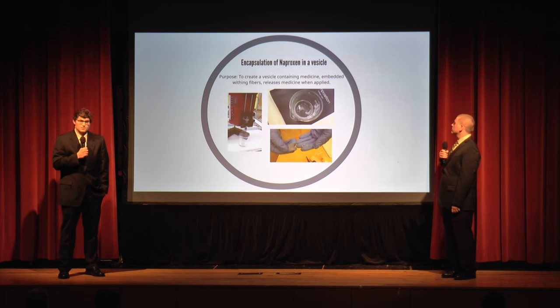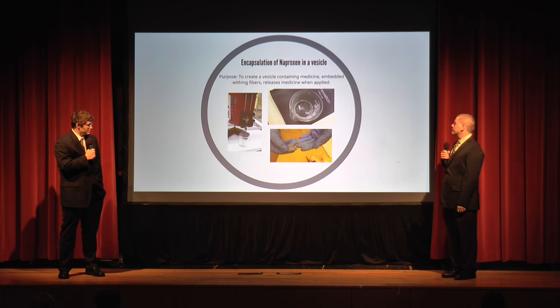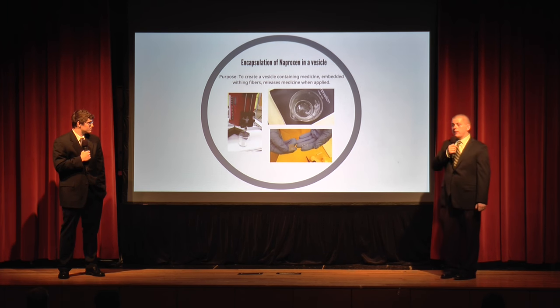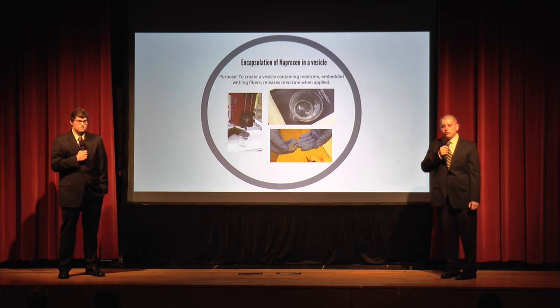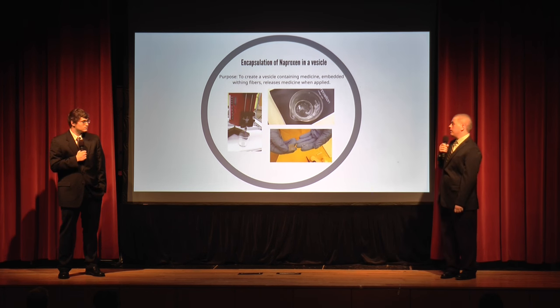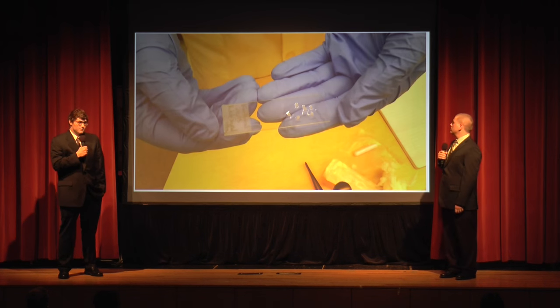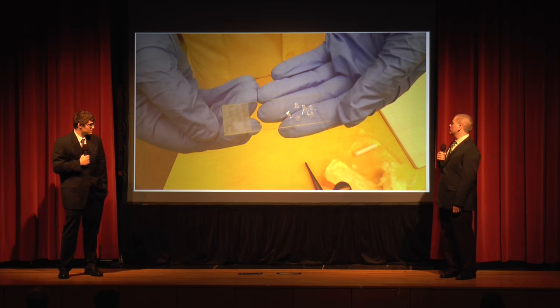The purpose behind medicinal encapsulation is to embed vesicles containing medicine into the fibers to be introduced directly into the bloodstream through the wound. The image on the left shows our encapsulation process. The solution within the syringe reacts with the solution in the larger beaker to form vesicles trapping naproxen and deionized water into the vesicles as seen in the image at the top right. This image shows our capsules on a glass slide ready for optical microscope analysis.